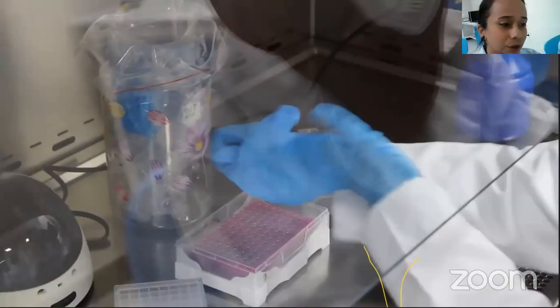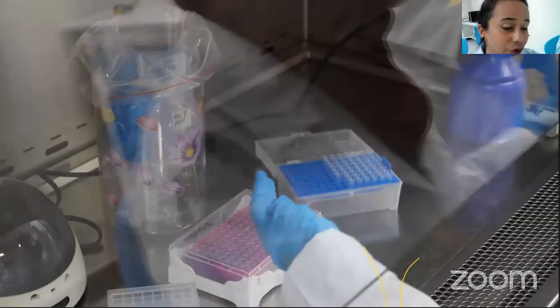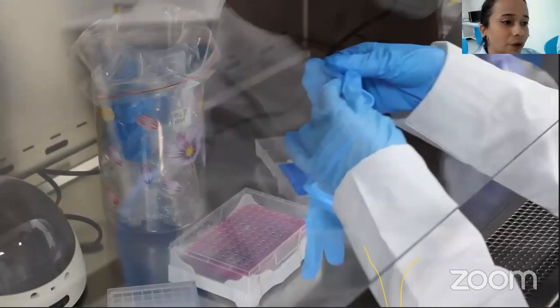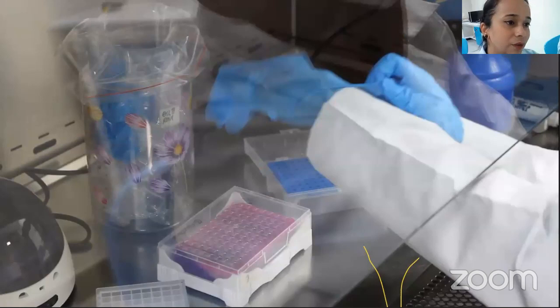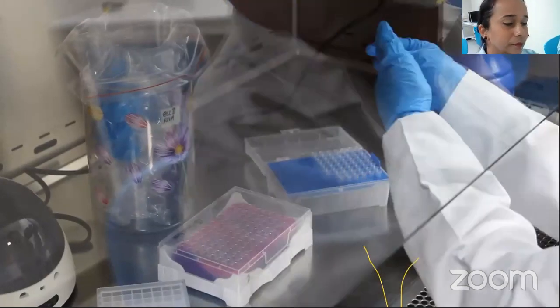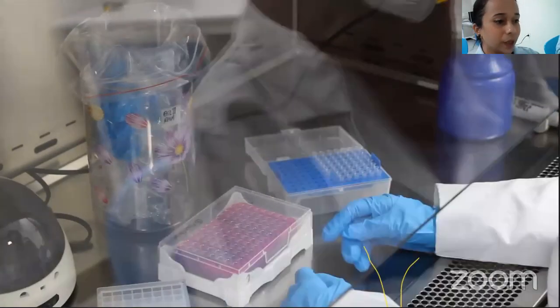This is what I was talking about, because in the safety cabinet, her hands should not be bare. There should be an inner pair as well. Now she is wearing a fresh pair of gloves to proceed with her test. Okay, now she will be proceeding with her plate.